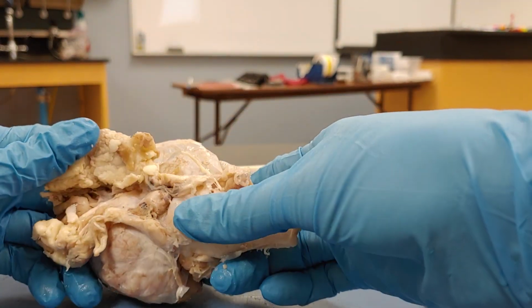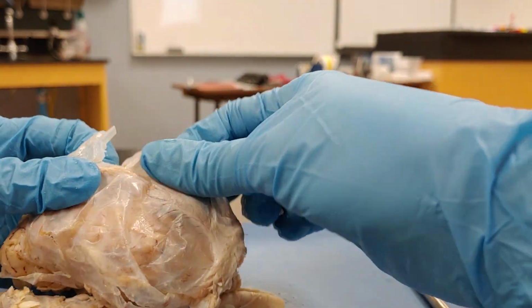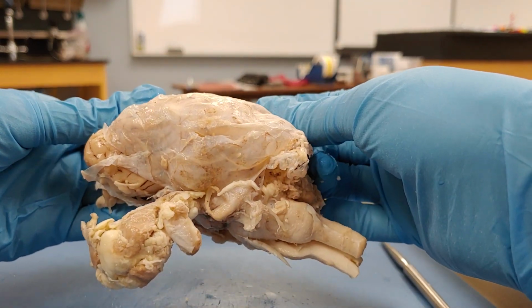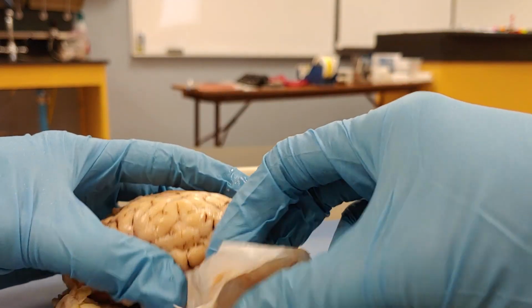Here is an overview of the sheep brain. If we start on the outer surface of the brain, we see this tough material here. This is the dura mater. The dura mater is the outermost covering of the meninges. When we peel back the dura mater, we see a few things.